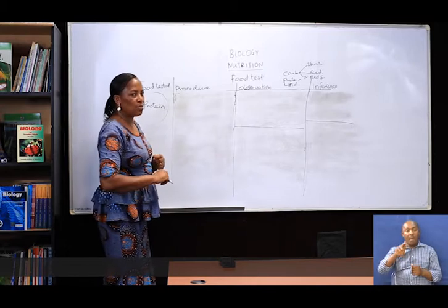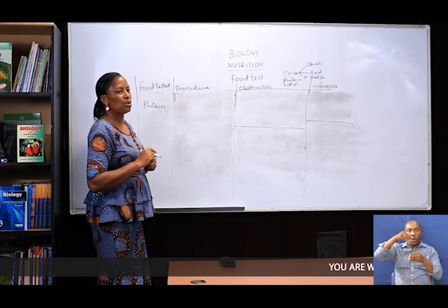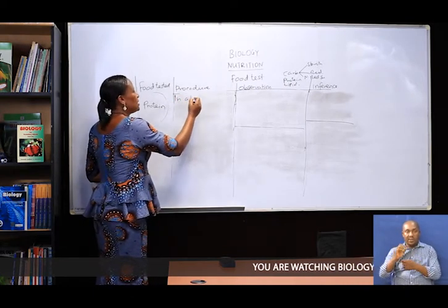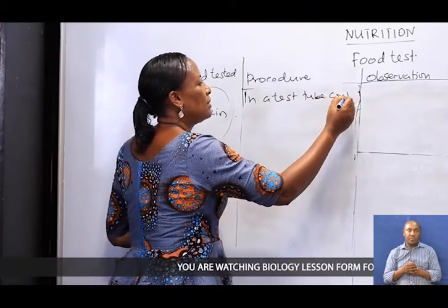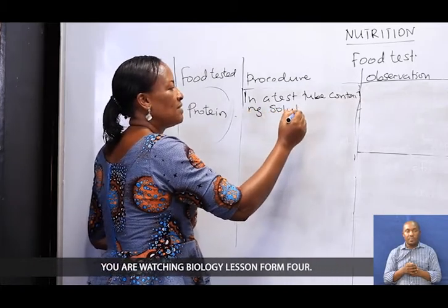In a test tube containing 2 cm³ of solution C.